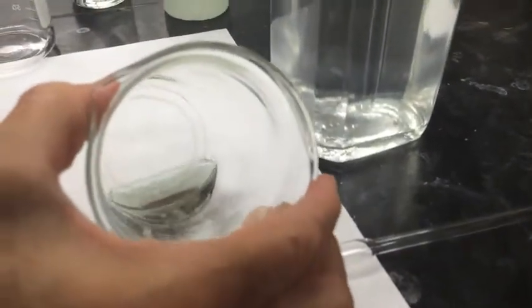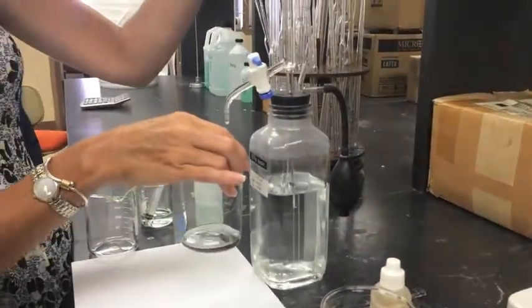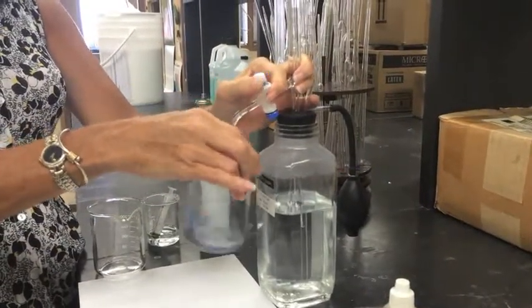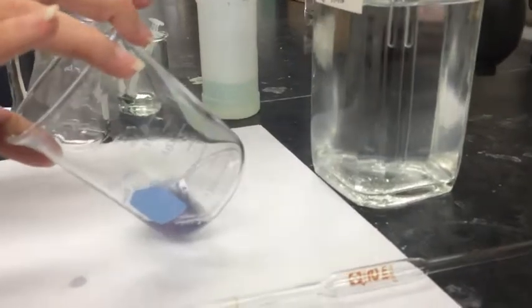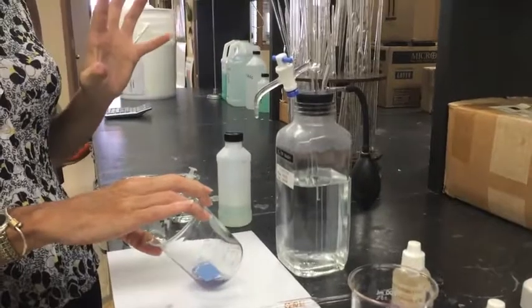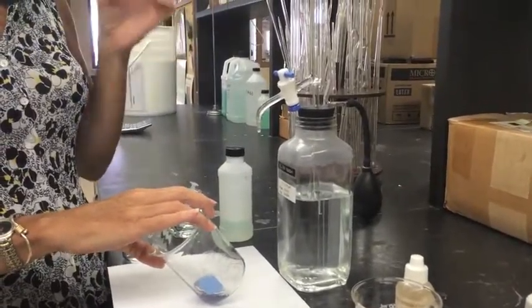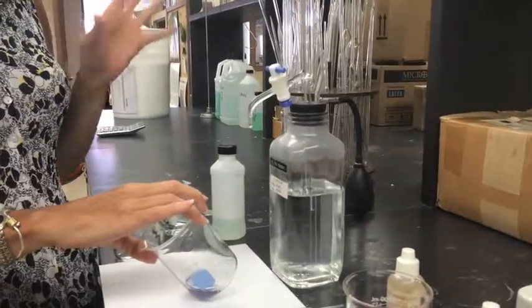And as you can see, our yellow is gone, and it's more of a gray-blue endpoint. And we'll take our reading, and it's 4.2. And I'm just going to purposely add extra, and you see it goes to a little darker blue. So if you go further than the endpoint, you will get the correct color, but you're not going to get an accurate number on your reading. So take your time. When you start seeing that color change, slow down, add less, and you'll get a more accurate reading when everything comes to fruition.